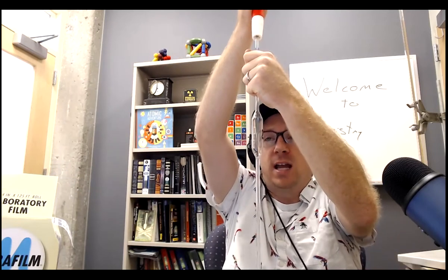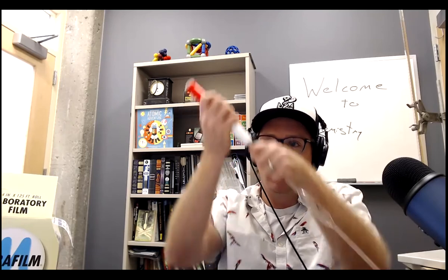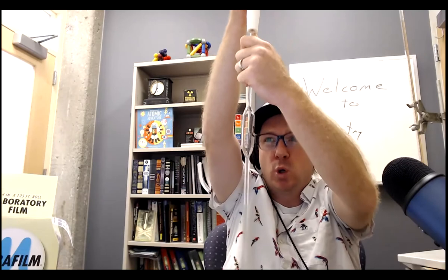I can't remember what I just said. So sorry, you hold your pipette in your non-dominant hand. You hold the pipette aid with your dominant hand because you need some dexterity with your thumb over here. You put that over the top and you just kind of gently put them together. You don't have to crank or turn. There's no threads here. I've seen people do some crazy things here. This is glass. You can break it. So you just kind of gently insert it. That's it. And then you put it in your solution and you pull up a little.